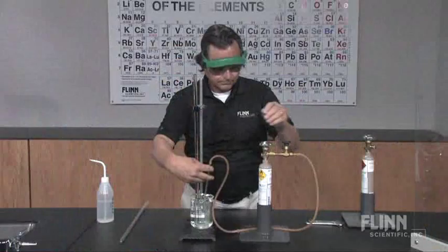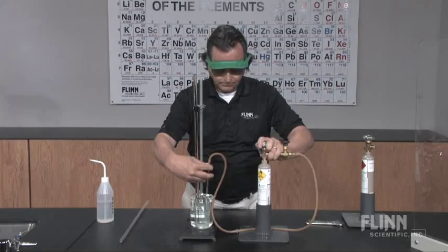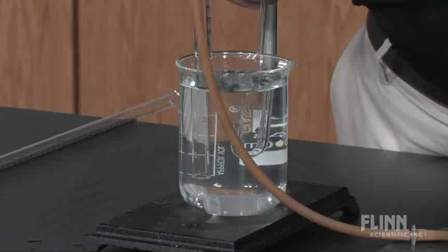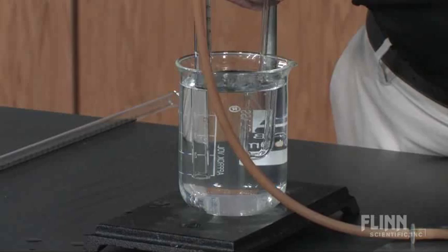With the regulator valve closed, open the cylinder valve. Place the glass tubing in the water away from the opening of the eudometer tube. Slowly open the regulator valve until gas bubbles flow out of the tubing. Adjust the gas flow to a slow stream of gas.